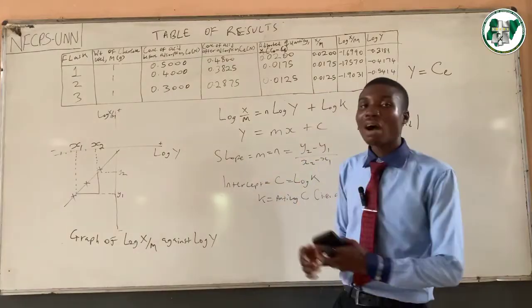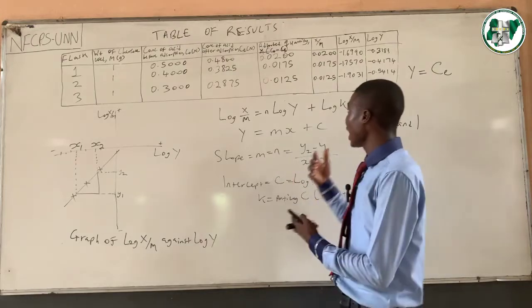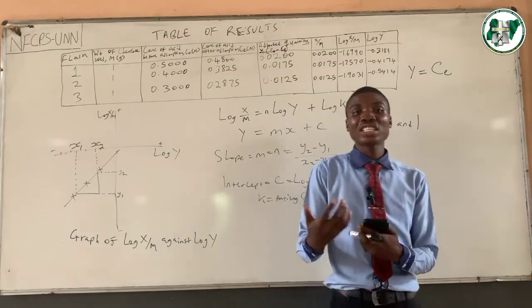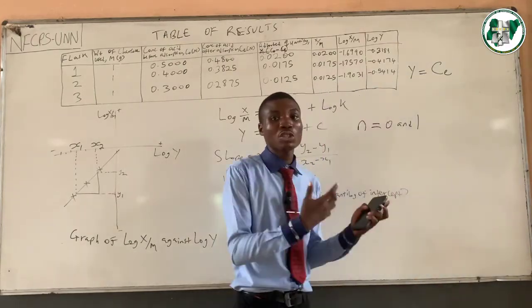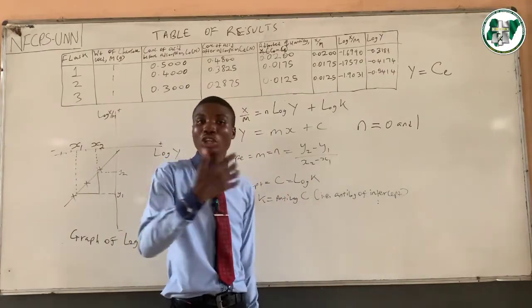So with that, we have been able to complete the adsorption experiment. If there are changes in the concentrations of the things you are using, the same formulas, same theories I've explained earlier on are what you can use to navigate through such challenges.